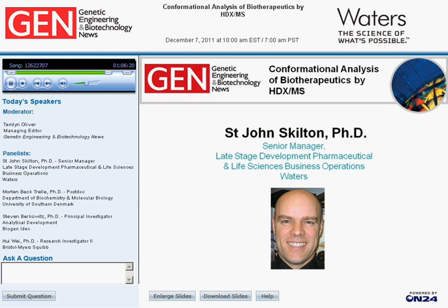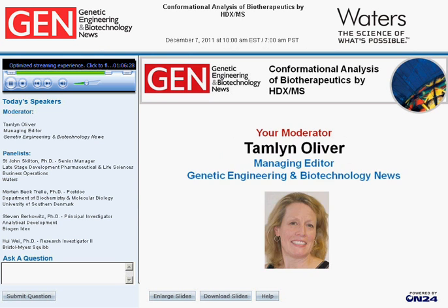Okay. Dr. Jorgensen, I have a question for you. How does HDX protection at the flexible region compare to the X-ray crystal structure B factor? That's a very interesting question. The correlation between the B factor and the protection factor has been investigated by Walter Englander in a paper from '98 in Protein Science.